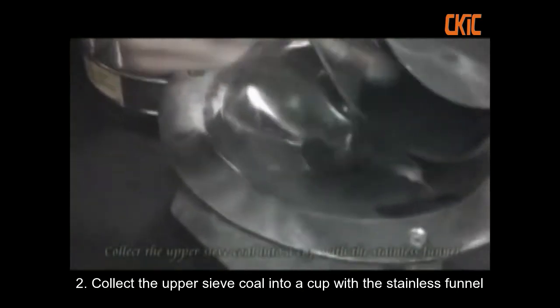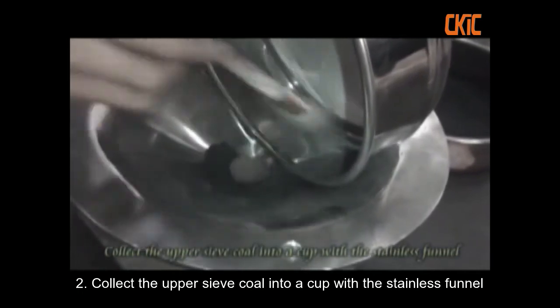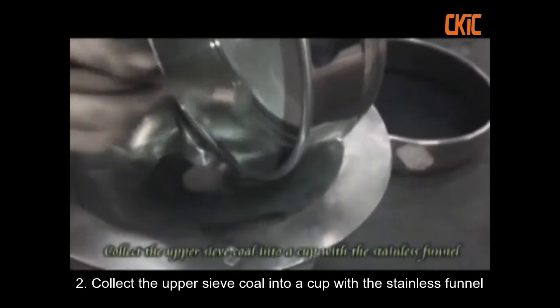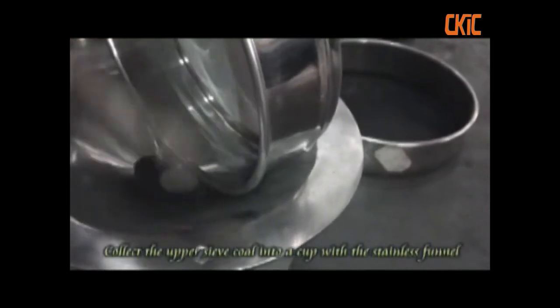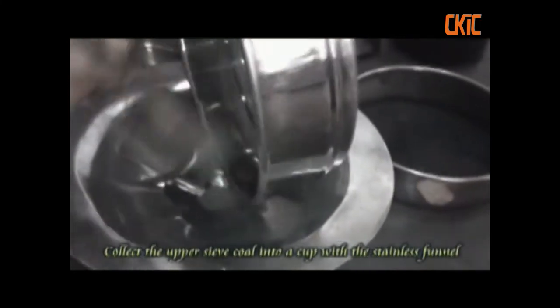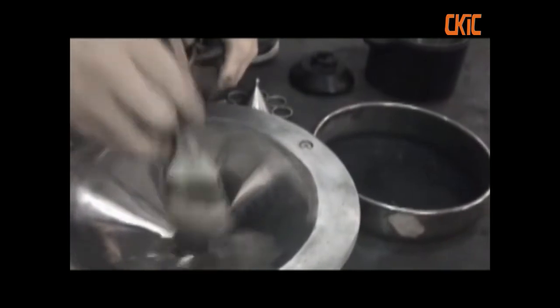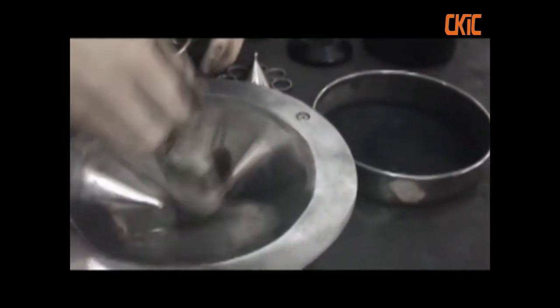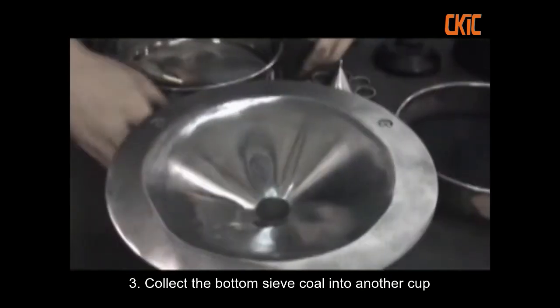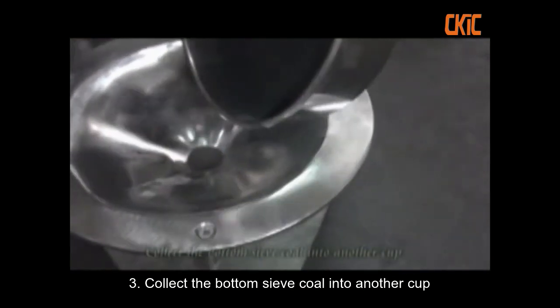Connect the upper sieve core into a cup with the stainless funnel. Connect the bottom sieve core into a cup.